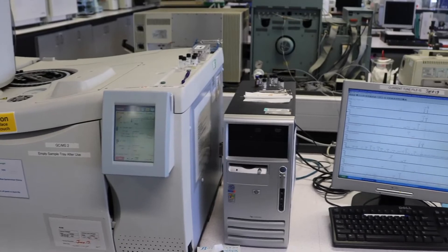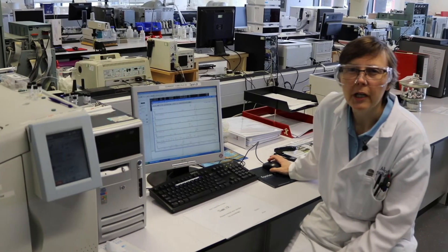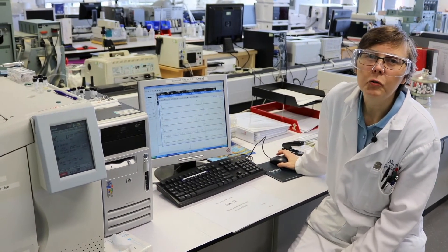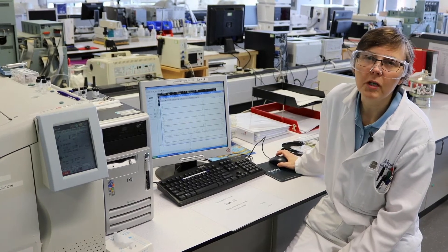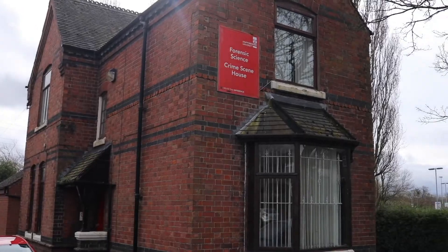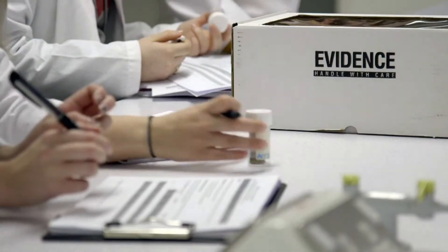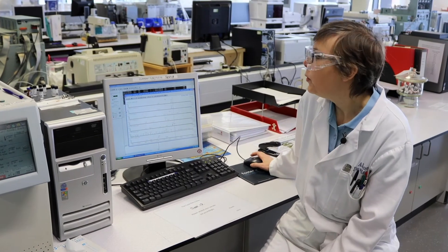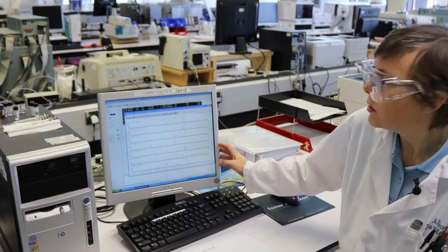So this is the gas chromatograph with the mass spectrometer that I showed you earlier. By the time you come into our third year, one of the big modules is called 'Investigating and Reporting Crime Scenes.' In this module you collect evidence from the crime scene, analyse it in the laboratory, and then you'll go to court to present your evidence. We use the GCMS for the analysis of drugs.